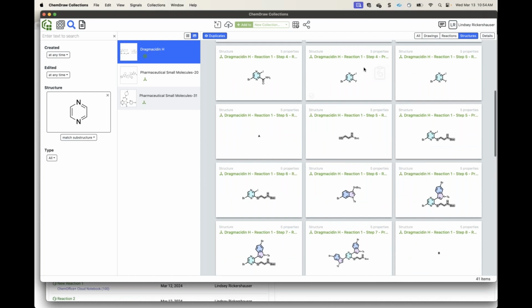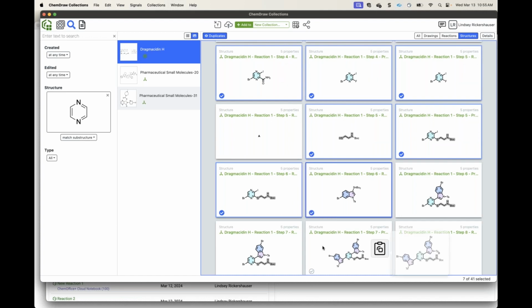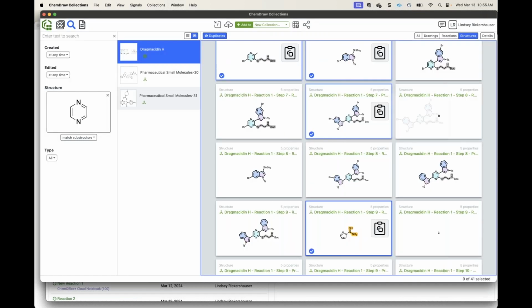So I can go ahead and select a few of them, and let's not select all of them, and create a chemical collection. So I'm going to add a new collection and call it dragmacidin H and create it. So what that's going to do is create my chemical collection. So what can I do from that, right?